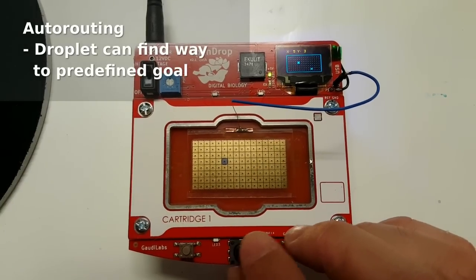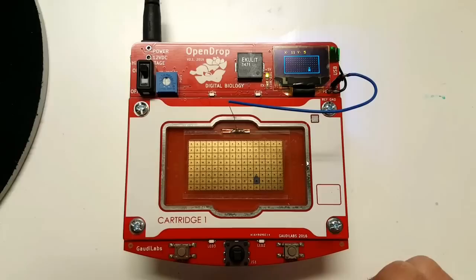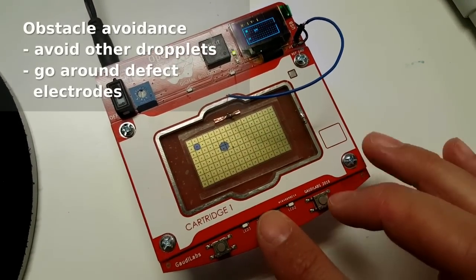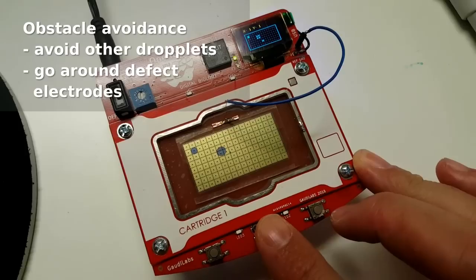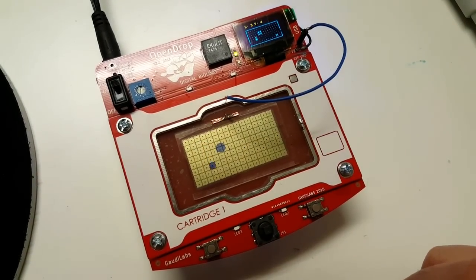Also implemented is an auto-routing. I set the goal, press the button, and the droplet will go to the position. The auto-routing will also avoid other droplets or could even avoid defective electrodes, as you can see here.